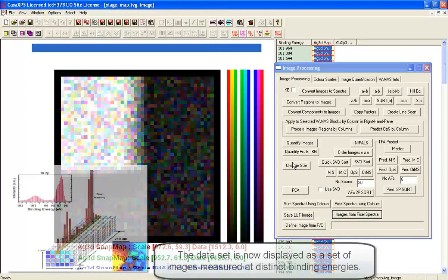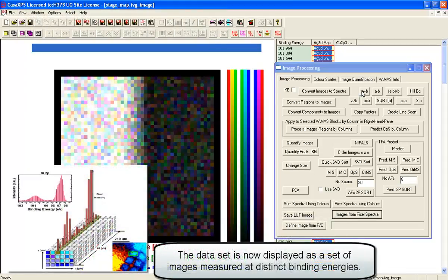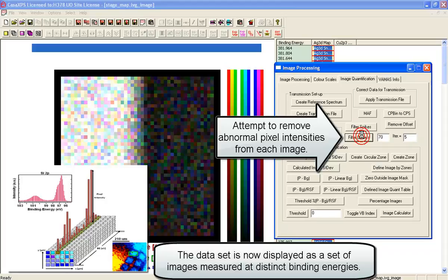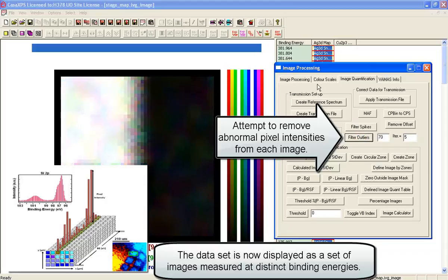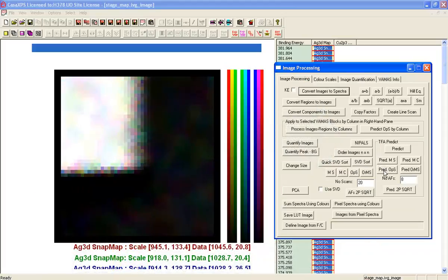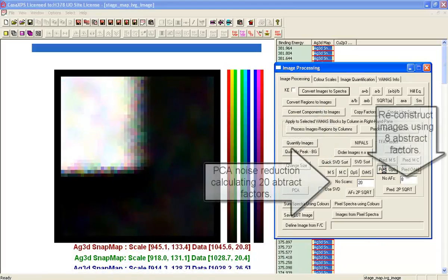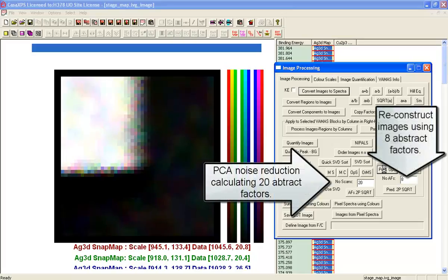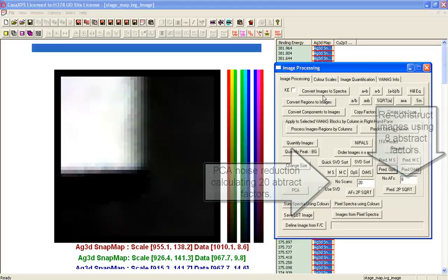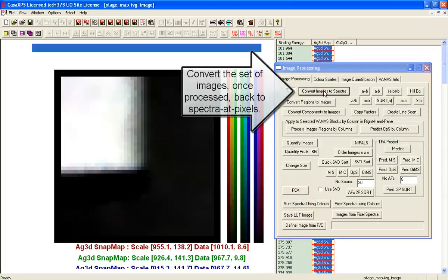For example, we could apply an outlier filter and we could then do a noise reduction based on a principal component analysis and then convert them back to spectra.